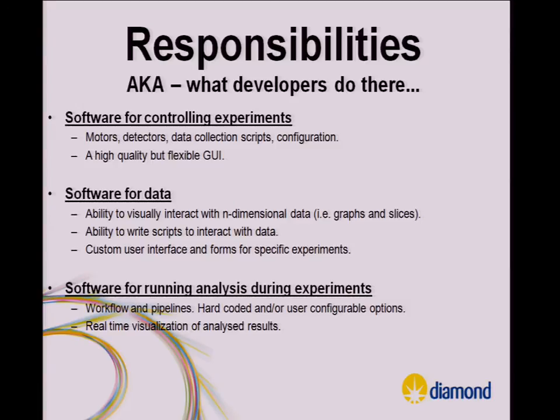So there's basically robots, motors that are moving various geared implements, and we have an Eclipse GUI for moving those around, and also an Eclipse GUI for setting up the detectors and recording the experiment, designing the experiment, running it, and saving the data.